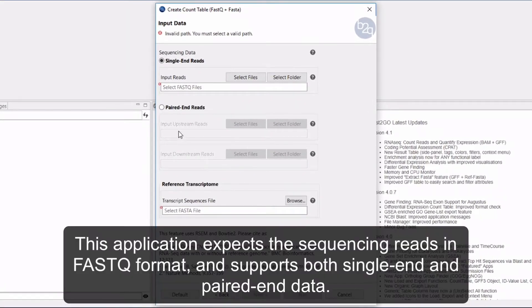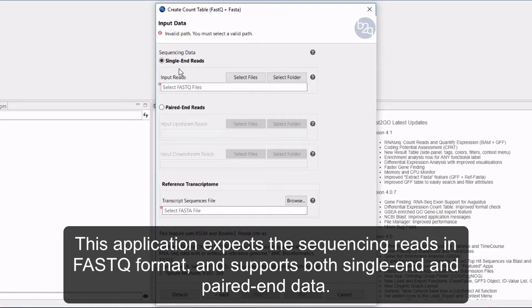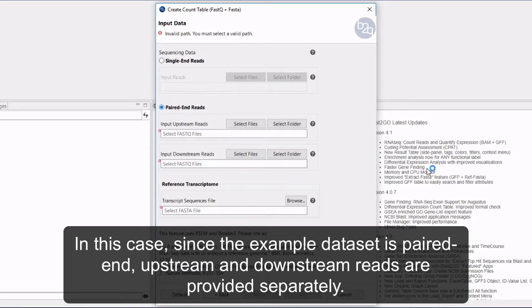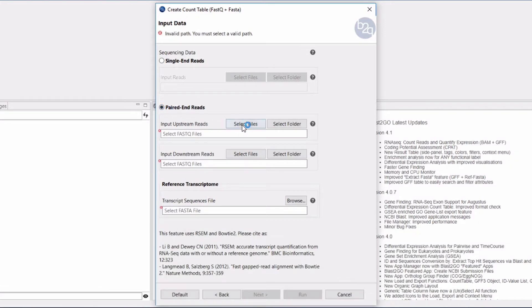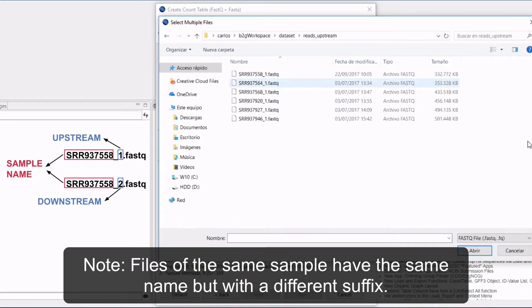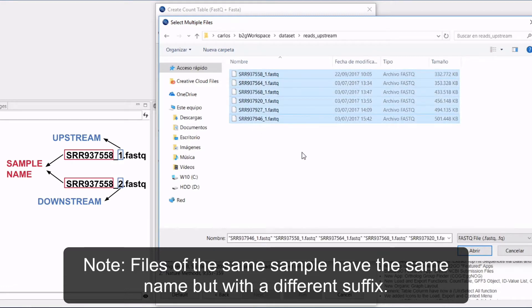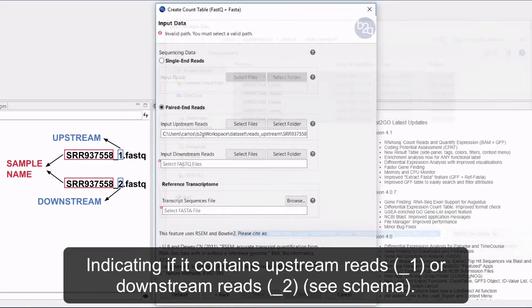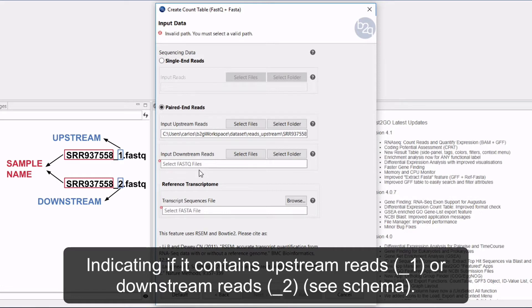This application expects the sequencing reads in FASTQ format and supports both single and paired-end data. Since the example dataset is paired-end, upstream and downstream reads are provided separately. Note that files of the same sample have the same name but with a different suffix, indicating if it contains upstream or downstream reads.